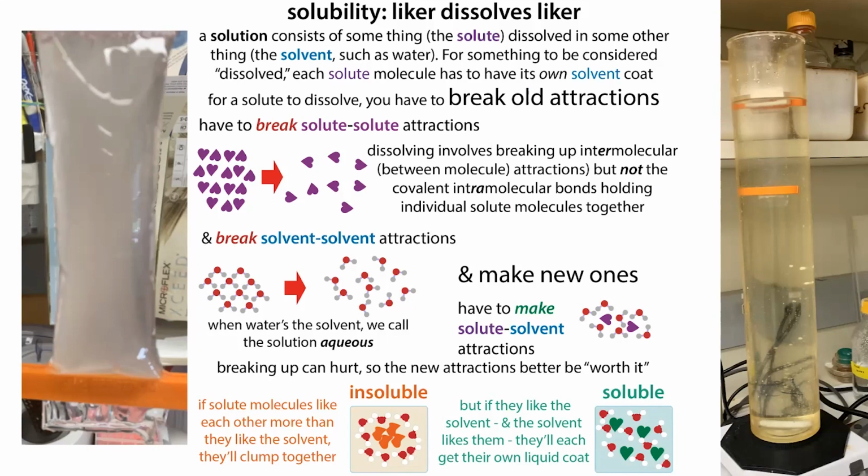In order for this to happen, the water molecules need to like bonding to your protein as much as or more than they like bonding to one another, and your protein molecules need to like binding to water more or at least equivalent to how they like binding to one another. If you tip the balance so that the water is less attractive and the protein is more attractive, then the proteins will bind to one another, and this can cause them to clump together. So we need to make it so that the proteins like the solution that they're in.